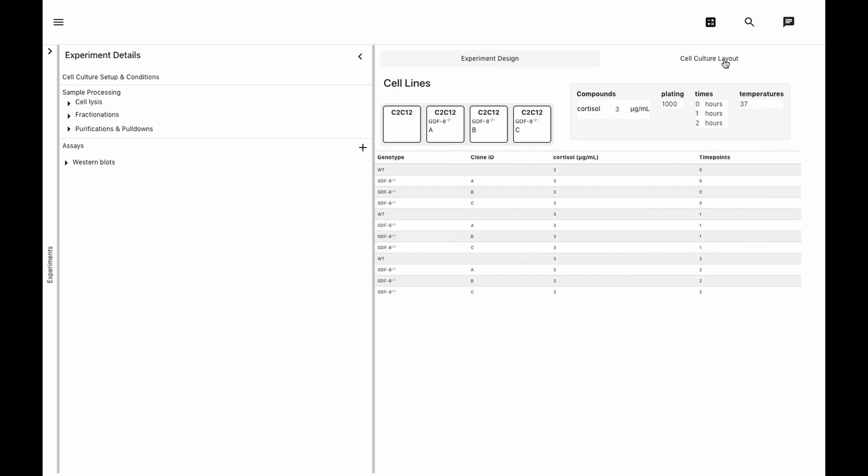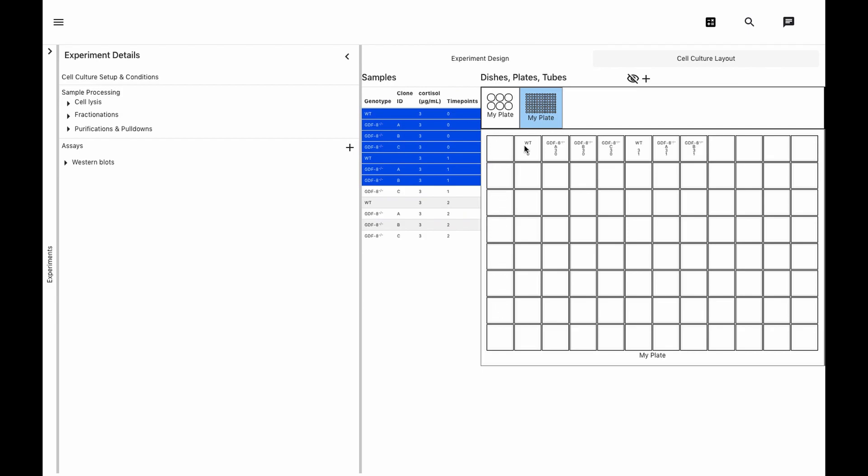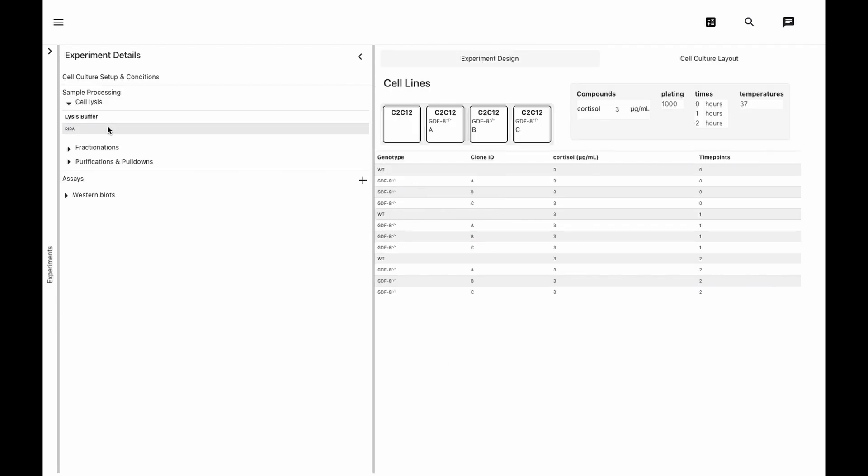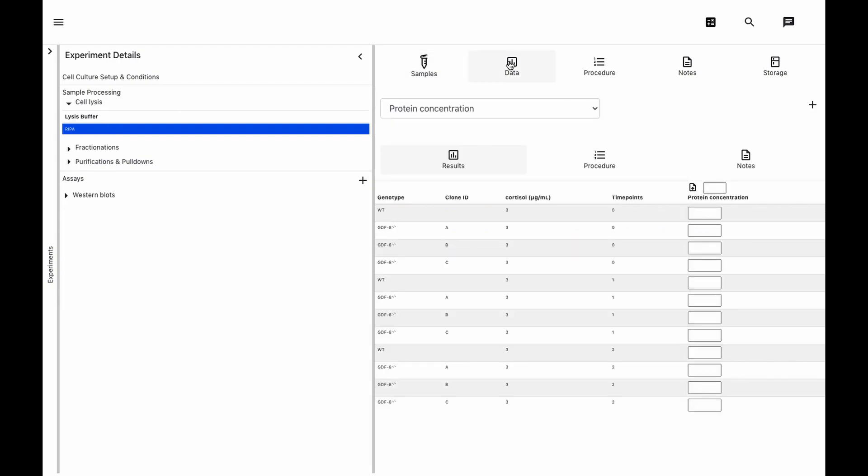Once we've confirmed our experiment design, we can map out and export and print our plate design. We set up a template so that our experiments automatically create a cell lysis step using RIPA buffer. Uploading lysate protein quantifications via spreadsheet or manually allows the software to automatically make calculations required for setting up our assays.